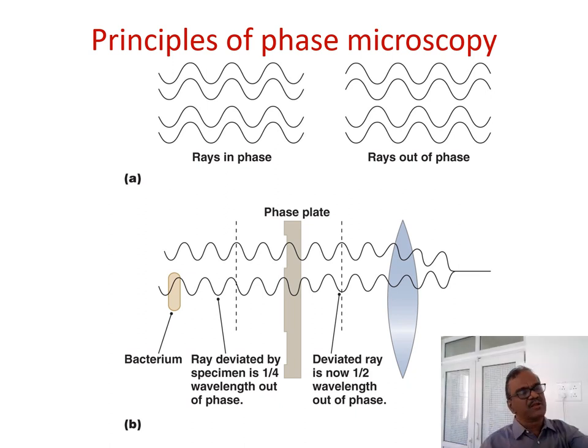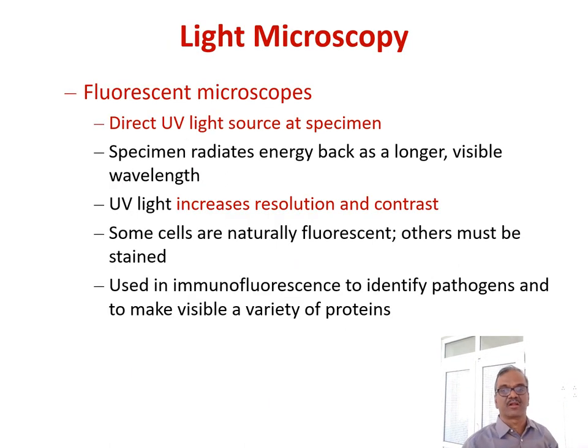Okay, and then depending upon this you can make different contrast, different thicknesses. You can see a cell wall or epidermal layer, you can also see the vascular bundle. Or if you are taking a cell, you can see a plasma membrane, at the same time you can see a nucleus under different contrast. Okay, so this is the basis for the phase contrast microscope.